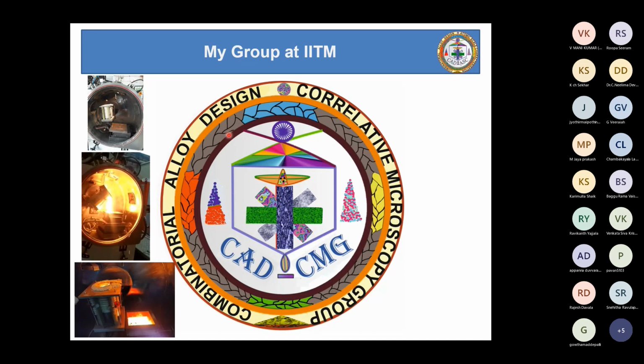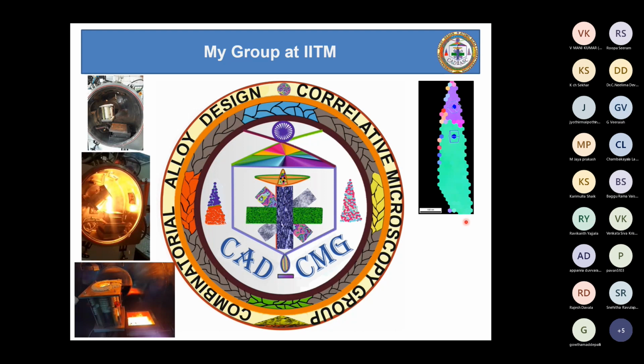The other half of our profile is correlative microscopy, where we utilize the material synthesized by this method, as well as tested for either magnetic or mechanical property, in a comprehensive characterization where all the analysis at the nanoscale happens on the same sample volume. This means we produce a sharp needle, which is required for atom probe tomography, and we do crystallographic analysis inside a microscope, where you can see the different orientations. If you see the scale, it is around 100 nanometer, so we have a tip produced with 50 to 60 nanometer diameter, and in that tip we have an interface. You can see the two different orientations of the crystals in two different directions, and that particular interface, which may have a different chemistry, is usually very difficult to characterize by conventional methods.